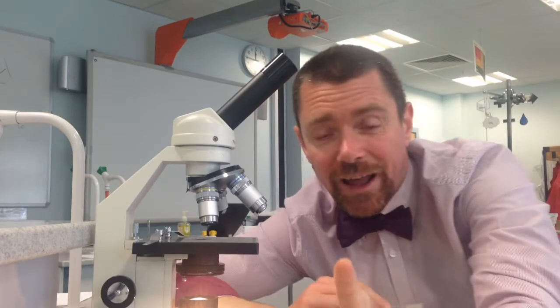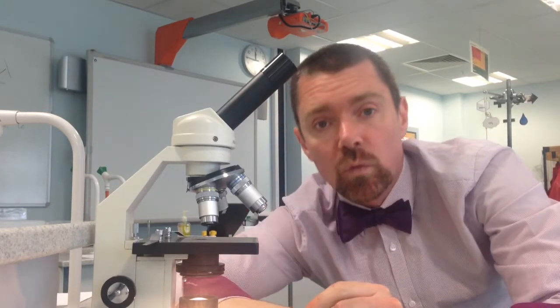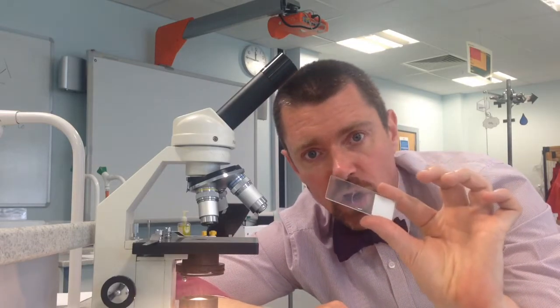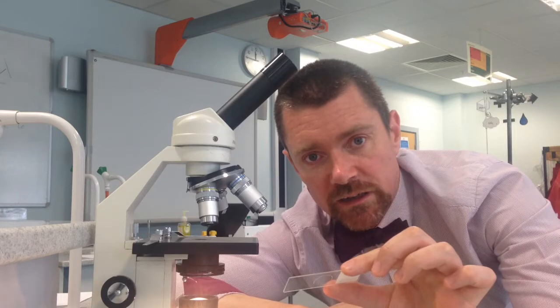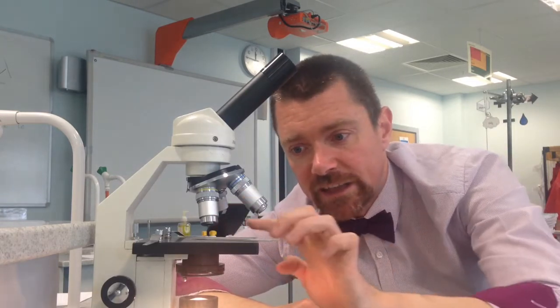We use the microscope to look at teeny tiny stuff. And when we want to use a microscope we need to put whatever it is that we're looking at — we'll call that the sample — onto a thing called a microscope slide, which is just a thin piece of glass. The first step is to put the sample onto the microscope slide. Once you've done that, the microscope slide goes on the stage.